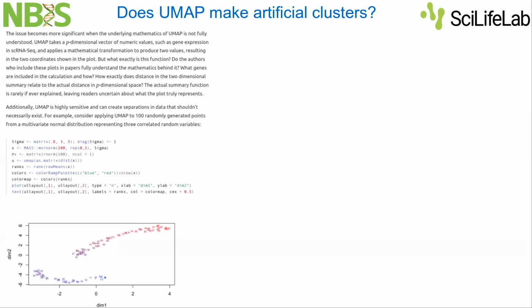That would probably not be accurate. But as just a fact, yes or no, I think UMAP is okay, at least in my feeling. But if you go to concrete distances, to extracting UMAP components and using them as variables for more quantitative analysis, not qualitative, I would be more careful with UMAP.